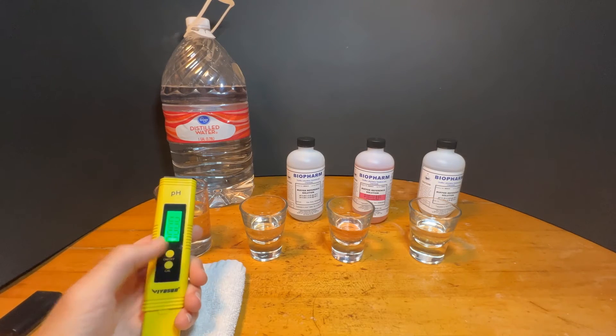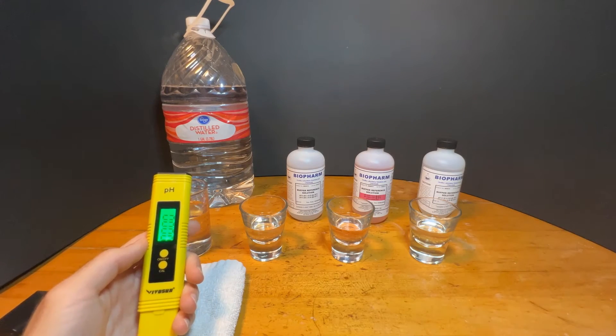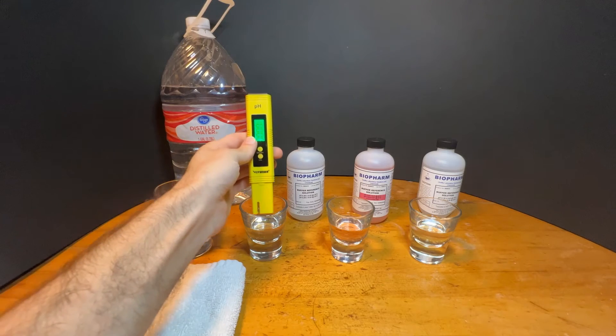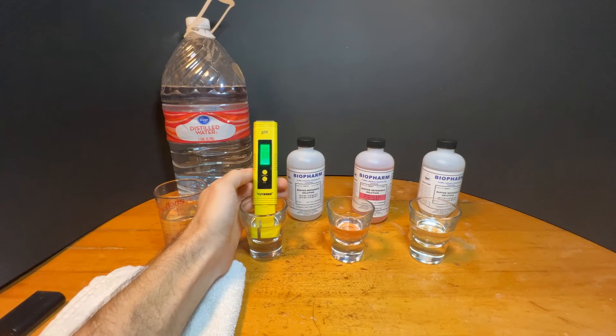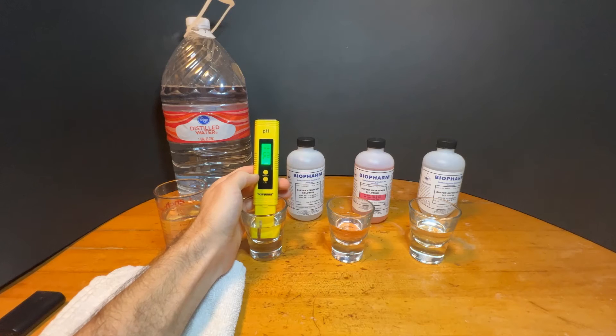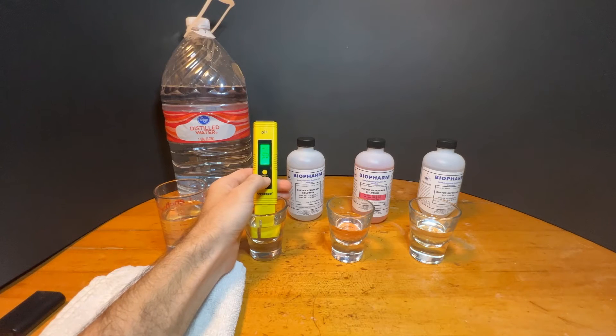Turn your meter on and place the tip into the 6.86 solution. My meter is reading seven. Press and hold the calibration button for five seconds. When the meter flashes three times, let it go.